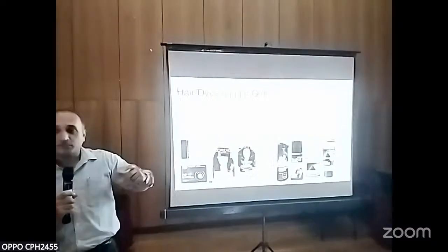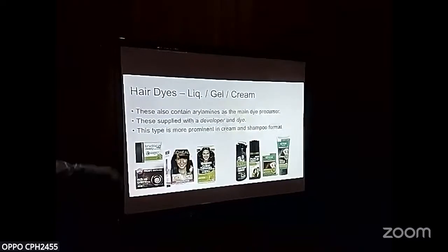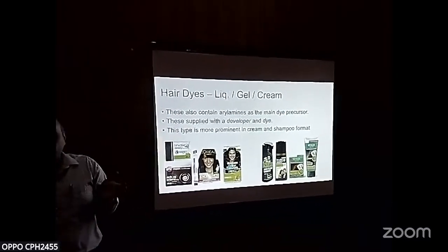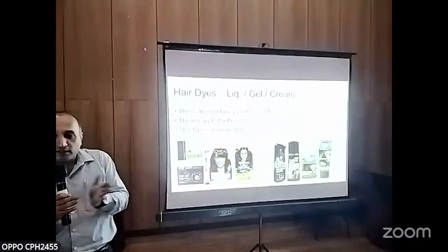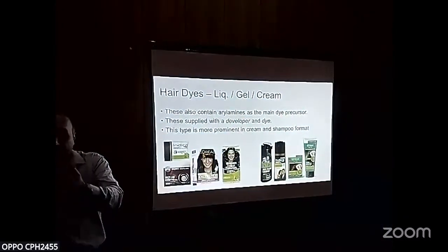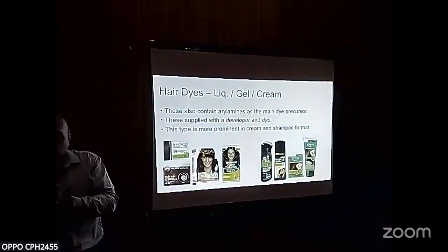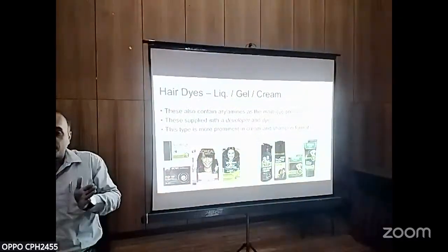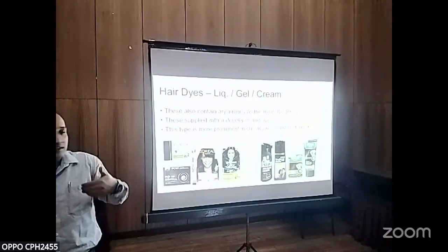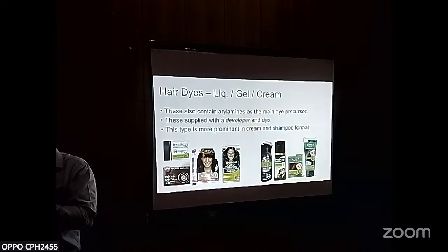But when it comes to the shampoo, the precursor is already pre-mixed and then it comes out. So once you actuate it, you will be getting the dye and the developer mixed together. It will be very difficult for an analyst like you to break down the packaging in such a way that you are able to separate the developer and the dye and then extract it separately and then see what the dye is.